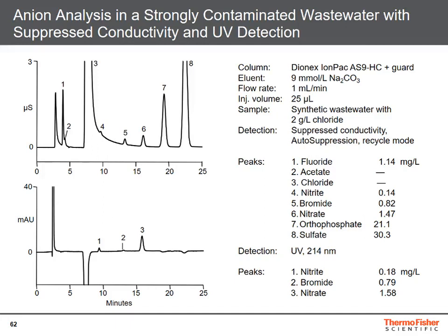And this is due to the high chloride content of the sample, which overloads even this high capacity anion exchanger, and therefore such a signal can easily be interpreted as a displacement signal. Eluent in this case is displaced by the large chloride concentration when it hits the column.